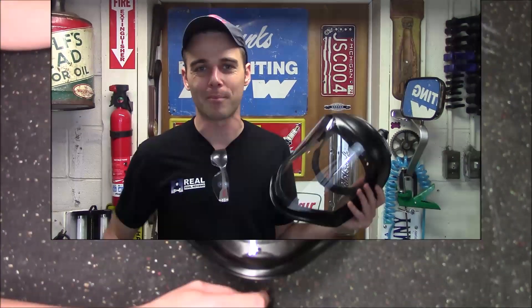If I had this shield on, the chemical would have gotten all over the front of it, probably damaged the plastic, but I wouldn't have been harmed. The worst I'd have had to do is pop out the lens and install a new one. In this video I want to show you the different features built into the shield, how it actually fits, and how to adjust it — because this really is a one-size-fits-all piece of safety equipment.